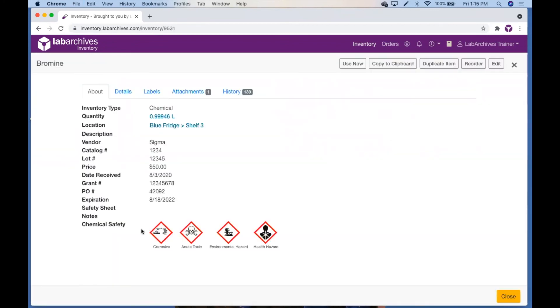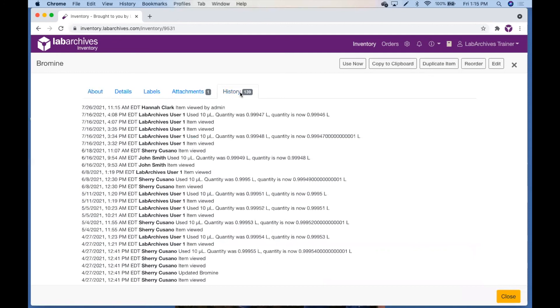After an item has been created in Lab Archives inventory, the item quantity, units, and location can be updated and edited directly from the item details tab. Any edits will be recorded in the item's history.